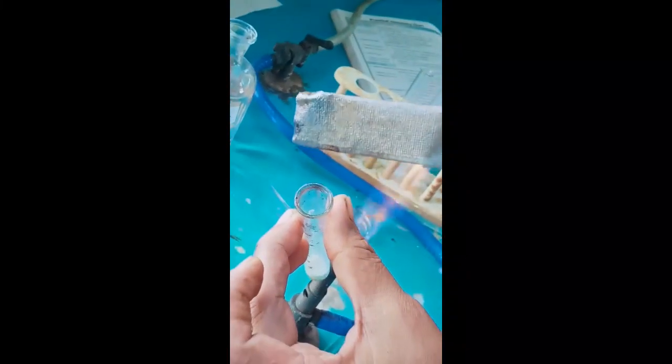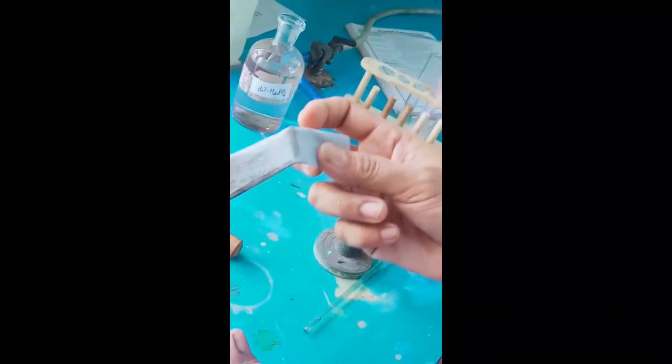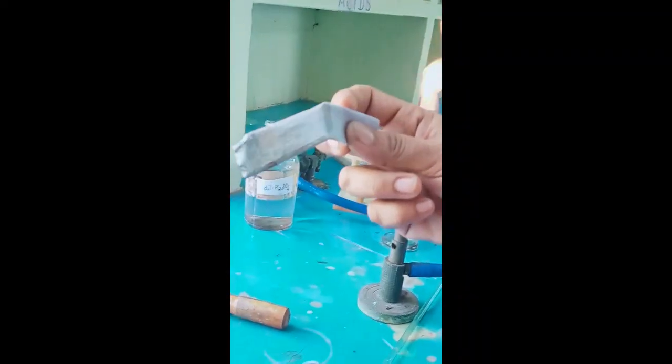Can you see the shining appearance of the paper? The paper turns silvery black. The lead acetate paper turns silvery black due to the evolution of hydrogen sulfide, and also hydrogen sulfide turns acidified potassium permanganate from purple to colorless and acidified potassium dichromate solution from orange to green with the deposition of yellow particles of sulfur.